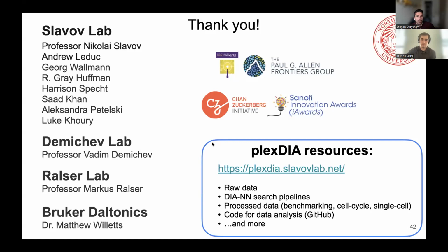Okay. We have a question from Isabel, who also says, great work. How much multiplexing do you expect to be possible for DIA before spectrum complexity becomes too big of a problem? So I suppose it's related to the question from Jan. Yeah, and it depends on how deep of coverage you actually want to get, because as you start to quantify more things, really complex spectra become more of a disadvantage.